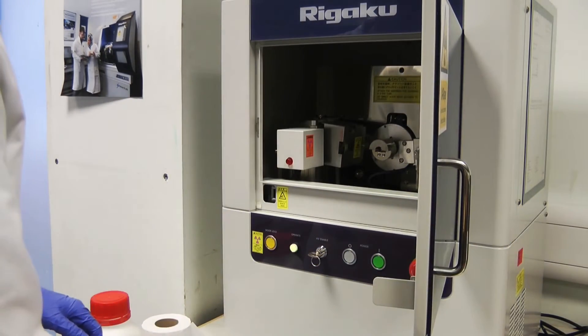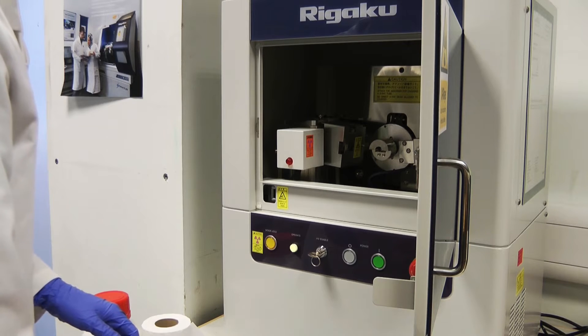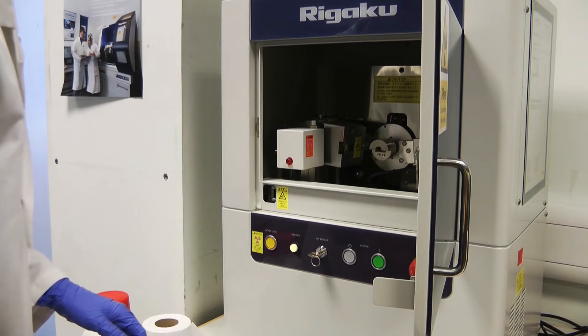The powder x-ray diffractometer contains three main components: an x-ray generator, the sample holder, and an x-ray detector. The detector is similar to a typical digital camera, except that it detects x-rays instead of visible wavelengths.